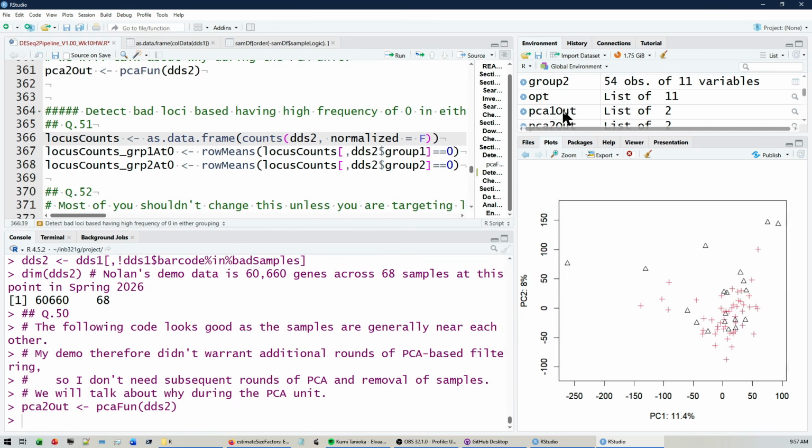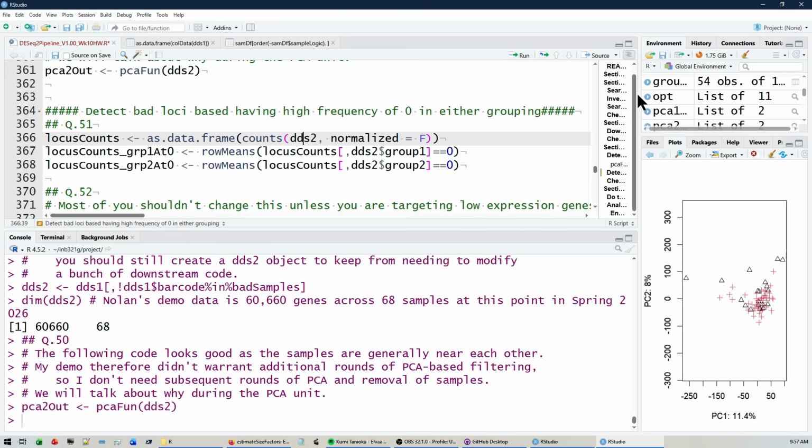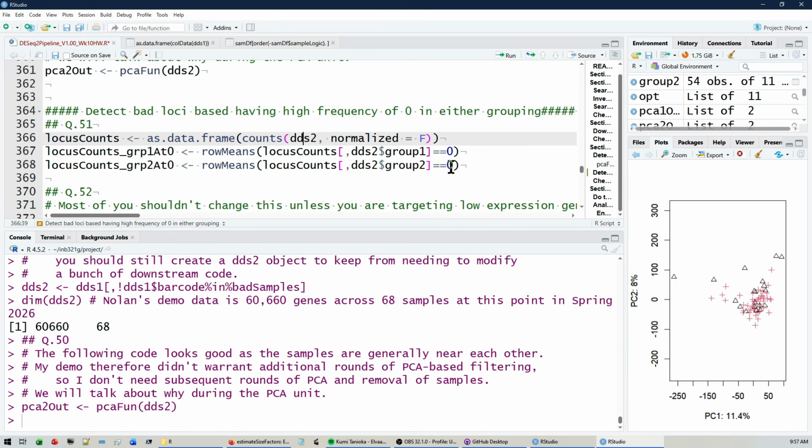Now this filtering section, you probably want to listen pretty carefully because this is one of the ones that students tend to not really understand what's happening. Probably because there were 366 lines of code into this and you're getting tired. But let's try to understand it carefully.